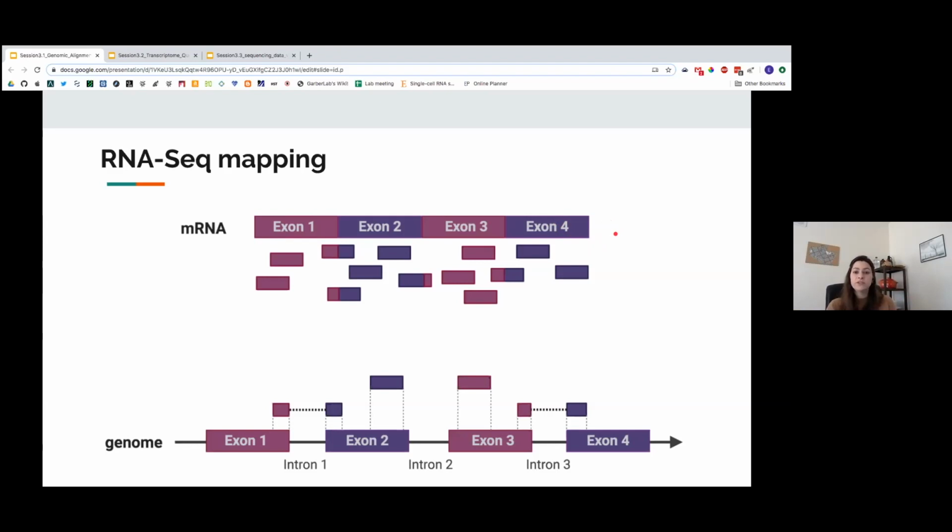The disadvantage is that it relies on having a quality transcriptome annotation. So if you're working with an organism that is not widely used, you probably don't have that available to begin with. And you're more likely to be stuck using the genome and then making inferences of where your transcripts came from. But there's also another issue, even for genomes where you do have a good reference annotation, and that is you will not discover potential new isoforms.